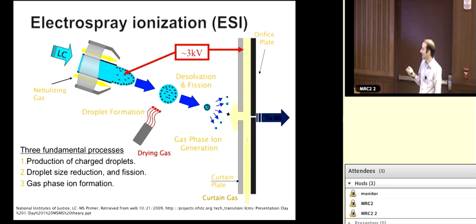Okay, so ESI. Let's talk a bit about pros and cons. As an ionization technique, it's what's called a soft ionization technique. Means it doesn't decompose your analytes, even if it's a complicated molecule, something like a protein or a big metabolite. It usually doesn't break down in the process. It doesn't fragment, so you can get the intact molecule into your mass spec.